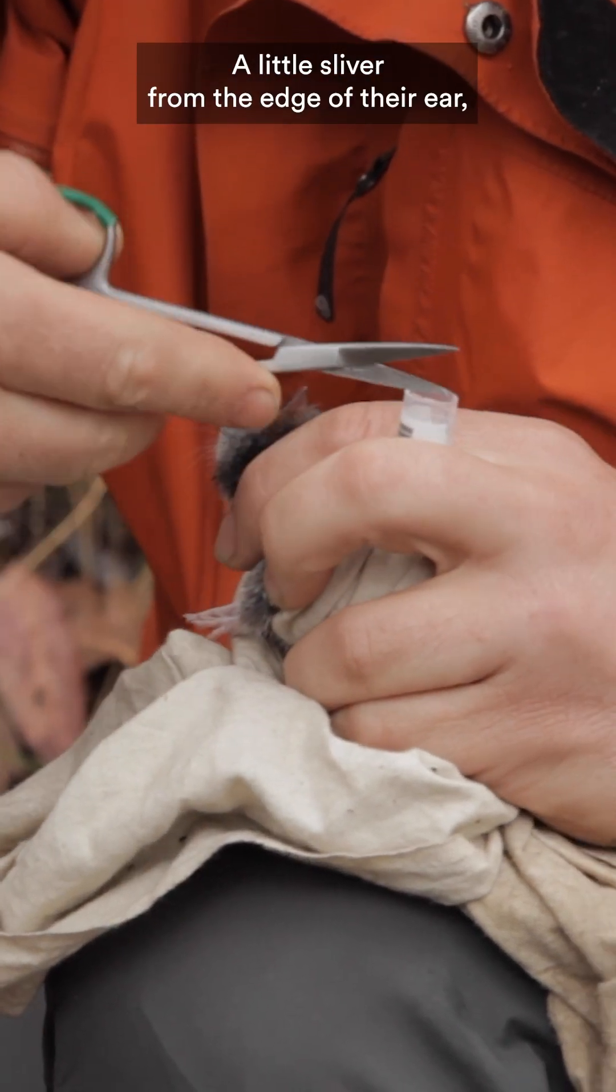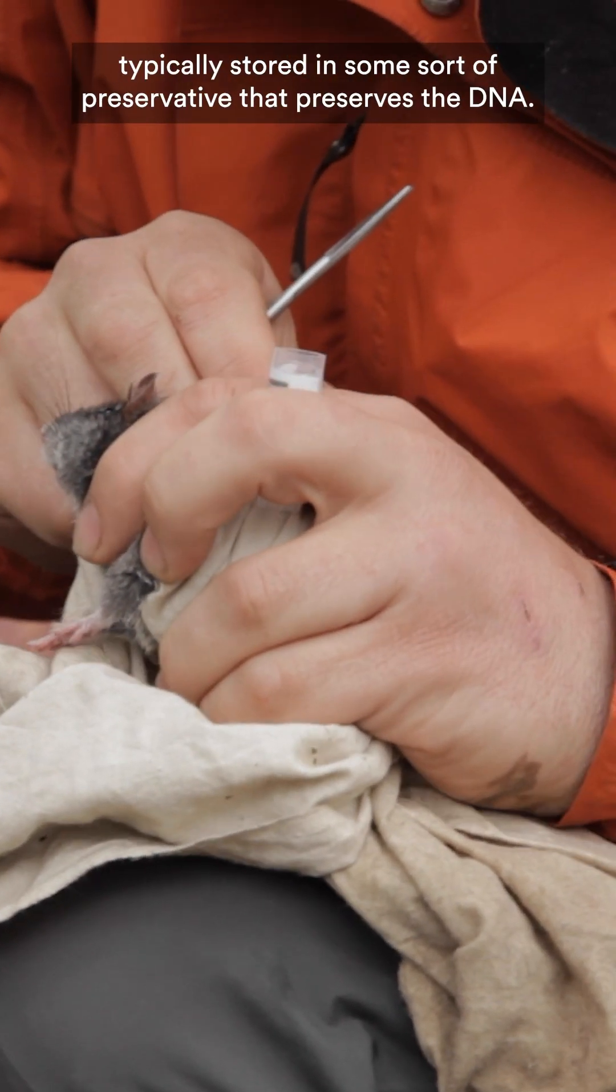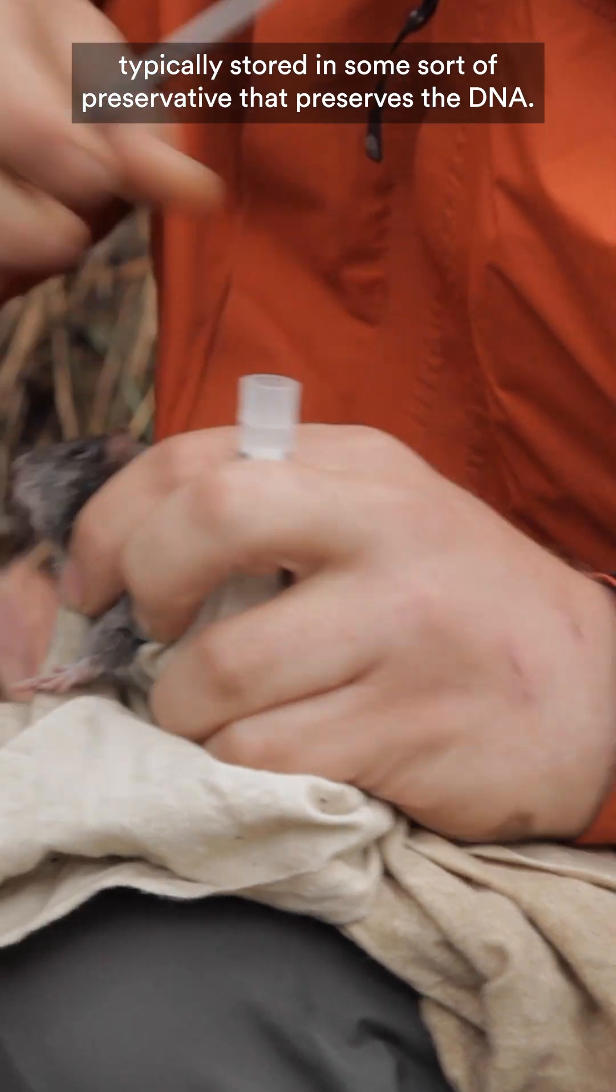We take a small ear biopsy, a little sliver from the edge of their ear, typically stored in some sort of preservative that preserves the DNA.